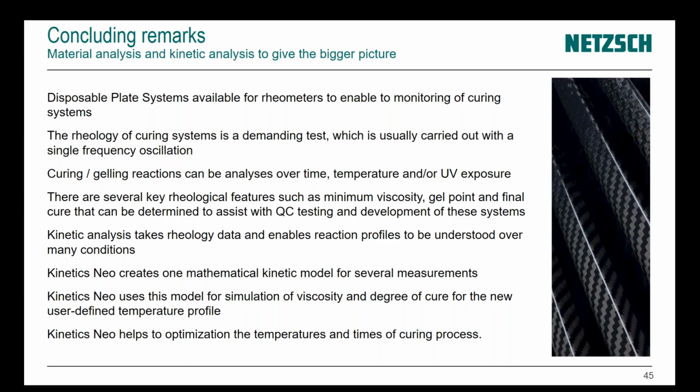So yes, we can look at the cure, we can get the measurements of the minimum viscosity, the maximum fluidity, gel point, final cure, we can understand it. But we'd like to also explain, just as Elena did very nicely, that we can do kinetic analysis. We can take this rheology data, we can look at DSC data, and other thermal analysis techniques to monitor the cure and allow us to model it. By modeling, what that means is now we can predict, we can optimize the systems. We can look to understand exactly the temperature profiles inside your systems. Can we look to see and reduce energy costs, for example? And that's the idea. We can put these techniques together to give you a fuller understanding of your materials.